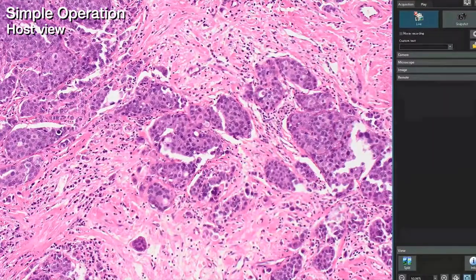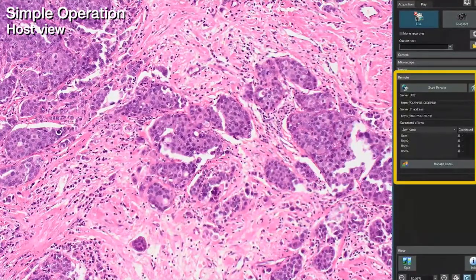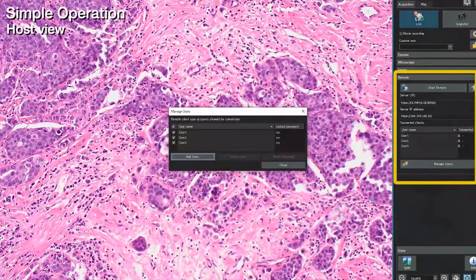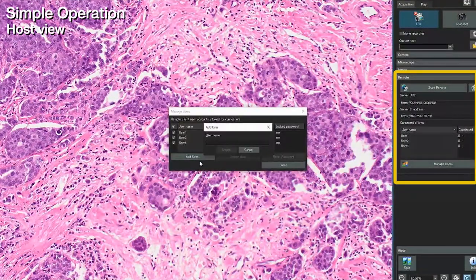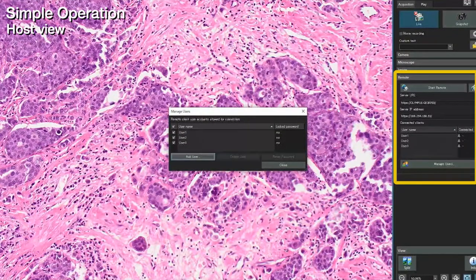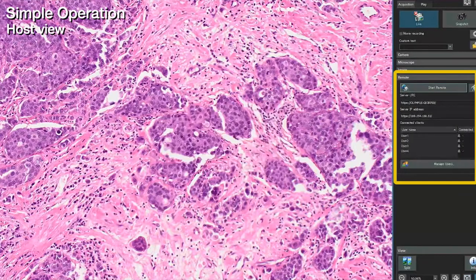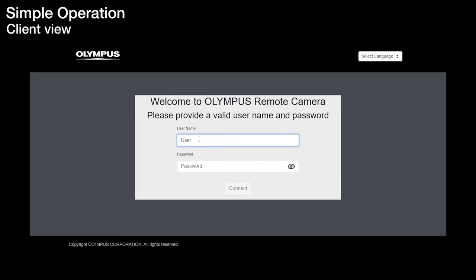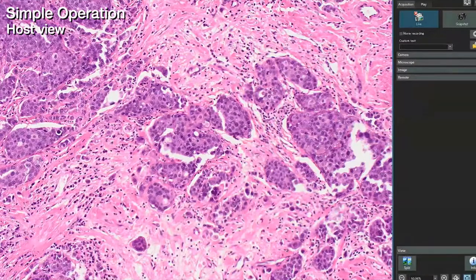Once the license is activated, Remote will appear in the software control panel. The host can decide who has access, create passwords for the remote connection, and generate the sharing URL, which can be emailed to colleagues. The host then clicks Start Remote. Colleagues enter their preset username and password, and the shared live microscope image will be displayed on the screen.